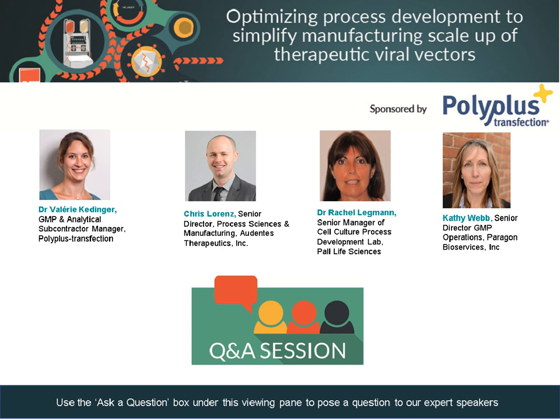The answer is yes. They actually all do. And for that, we've developed a method to detect residual PEIpro in virus samples at different steps of the viral production process. So this detection test is currently at the R&D stage, but we're in the process of optimizing the method for transfer to any analytical facility. And the goal of this transfer is to be able to validate this method that could be used as a release assay in the future if needed.